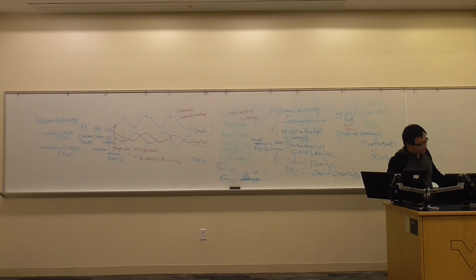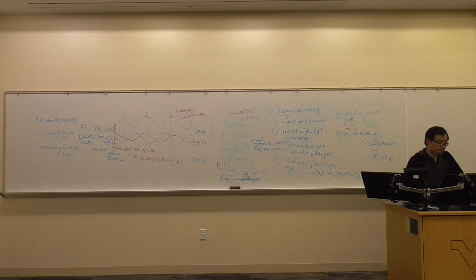And this is a very interesting slide. It tells you the range. For the scanning tunneling microscope, the resolution power, you can see the wavelengths, 0.1 to 10 nanometers. How about our light microscope? Above 100 nanometers. So they are almost 10 times or 20 times more focused.